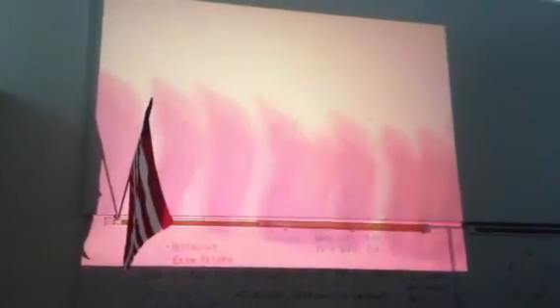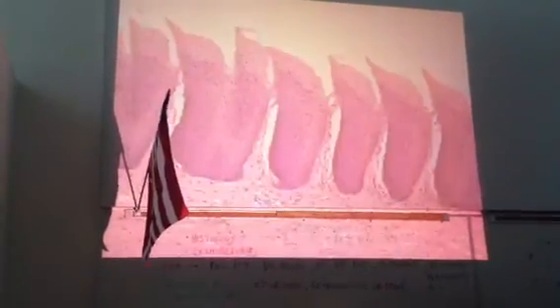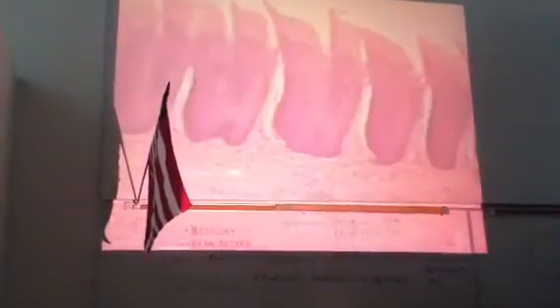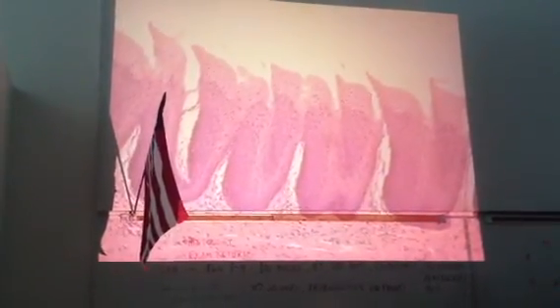Oh, I'm going to show you filiform papillae here. So the filiform papillae are spiky looking, and they don't have any taste buds, and there they are. I mean, they're pretty non-glamorous, but there we see them. Those are the only two that we have that show that. So just as a contrast to the fungiform that have the taste buds on the side.